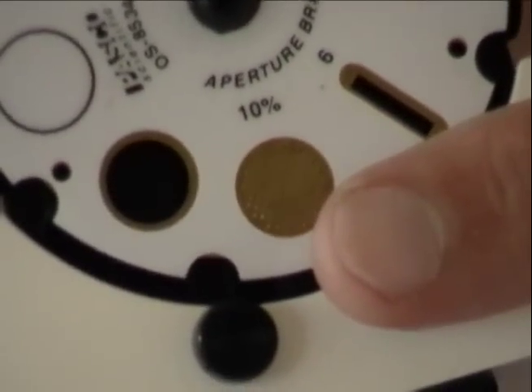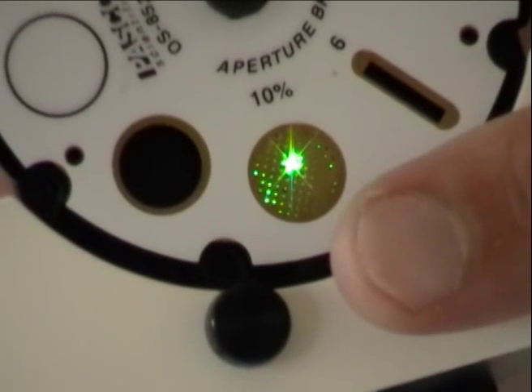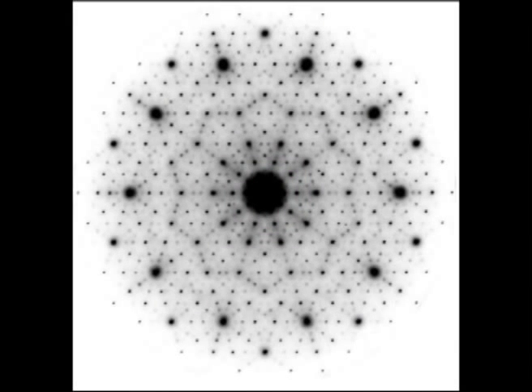Light waves fall on an object with a patterned shape, and it makes a diffraction pattern that can be easily analyzed and used to determine the original object. Whether it's a salt crystal, graphite, or even DNA, diffraction patterns have been used to image them all.